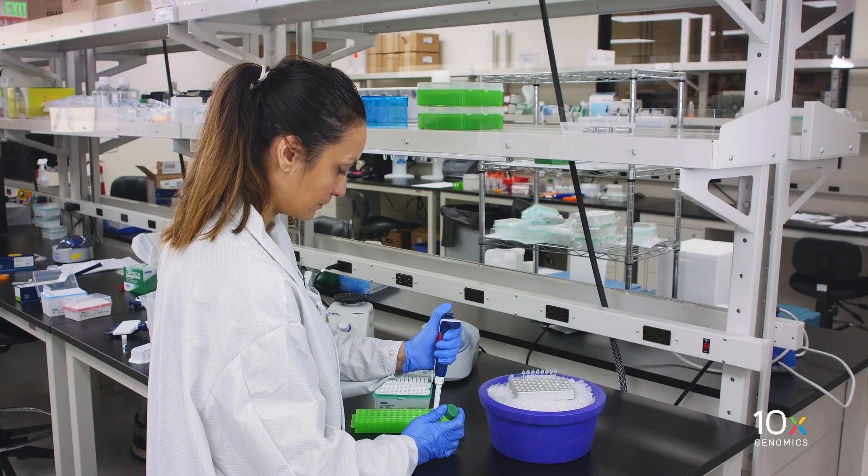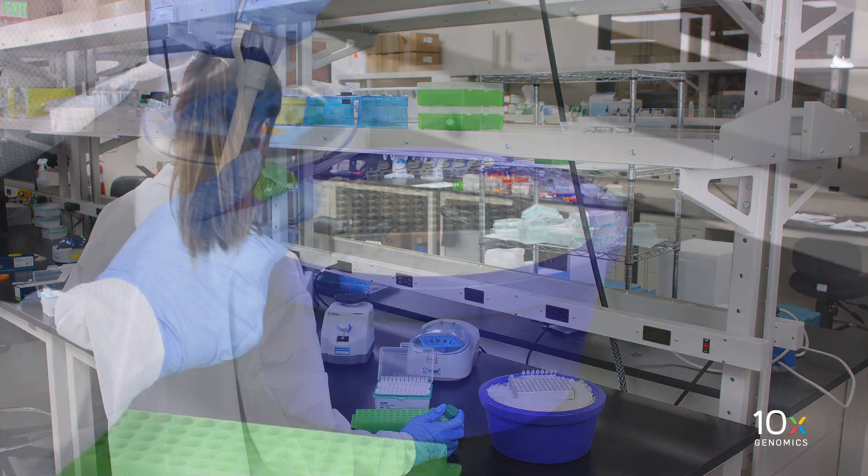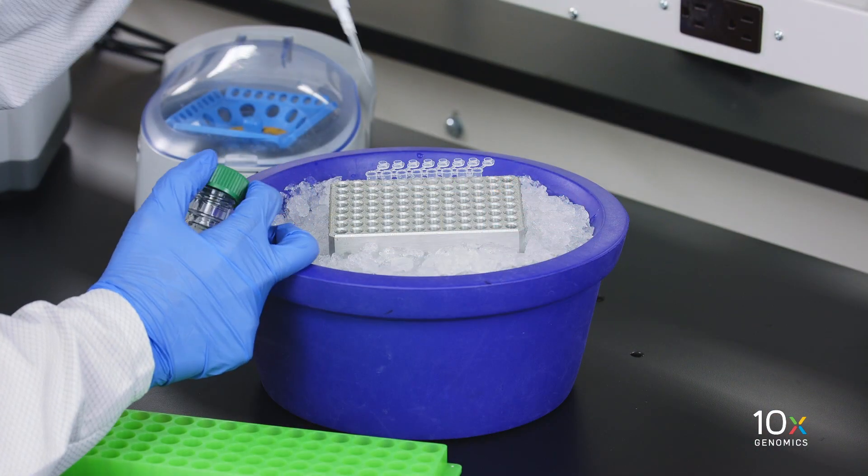Add 30.4 microliters of water into the aliquoted master mix for all four samples. The master mix should be on a chilled ice block.